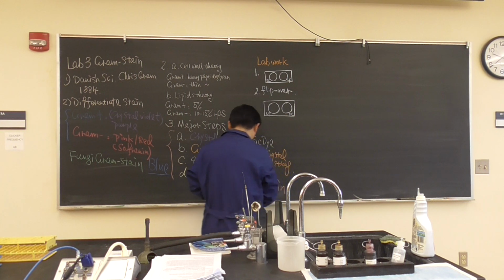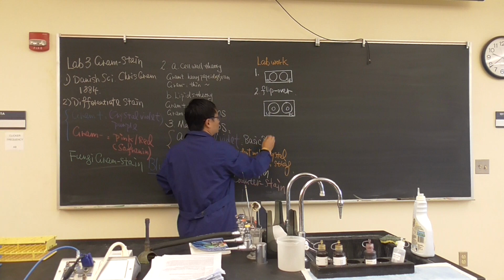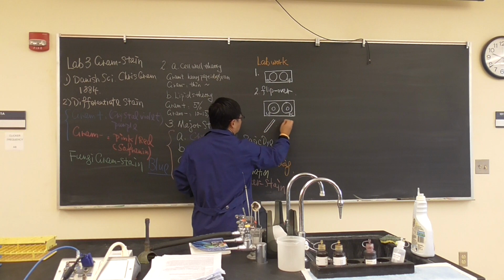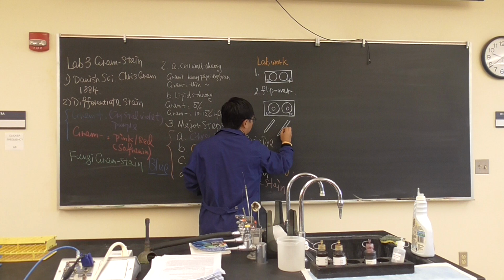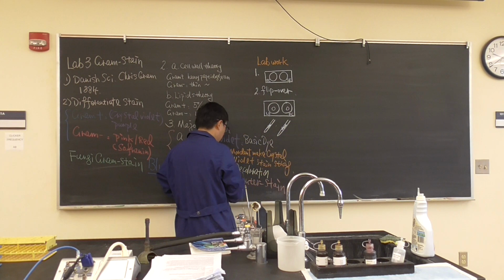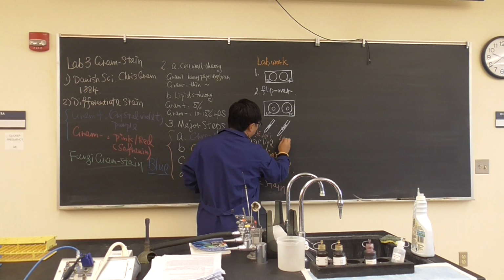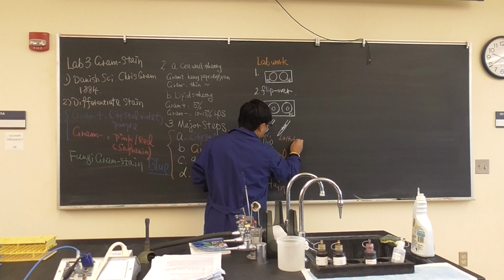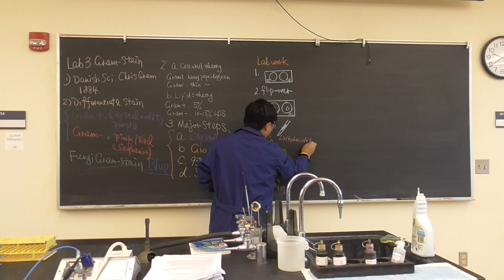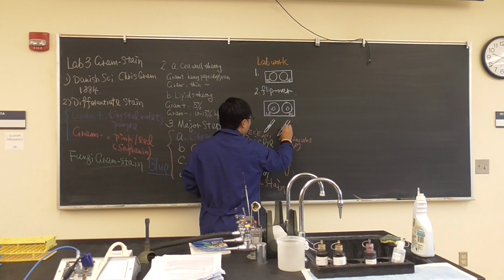So you add a drop of water, and then you also add bacteria there. Okay, the bacteria is on the slants. So two different bacteria, which are E. coli, where we put EC as an acronym, and lactobacillus, and this is why we put the LF there. So we're going to add there, and make a smear.